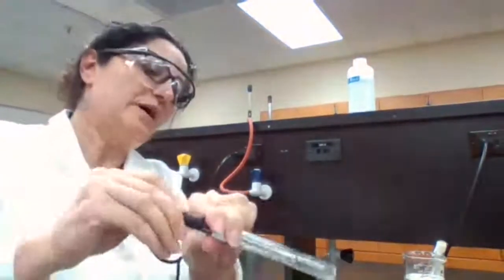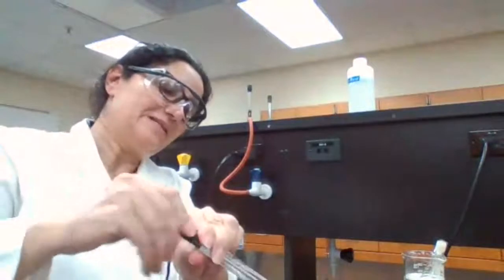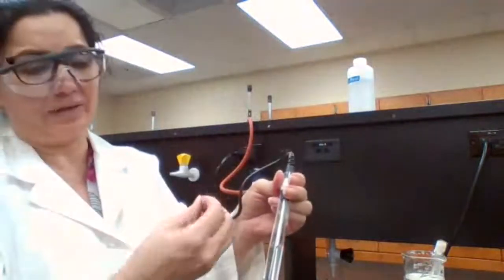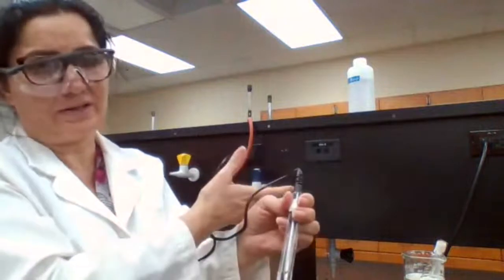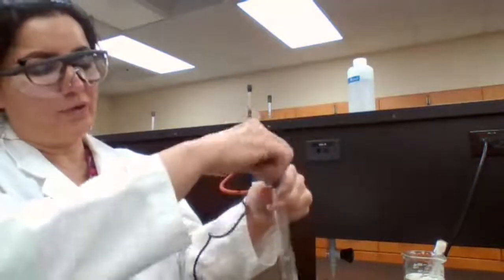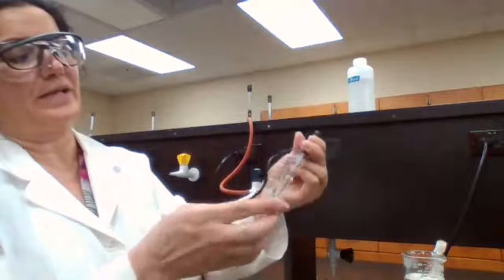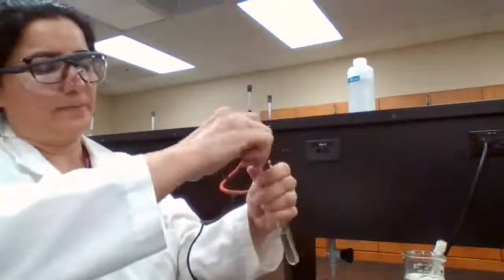You see, the temperature was high and it was high enough for it to dissolve, but since it was sitting and I wasn't stirring, it didn't dissolve. So I cannot say this temperature is the temperature that is dissolving because I took it out. It was hot before inside the hot water, so I cannot record that temperature. But what I could record, as soon as I see crystals coming out of the solution, I could record that as the temperature that it dissolved or temperature that crystals are forming.